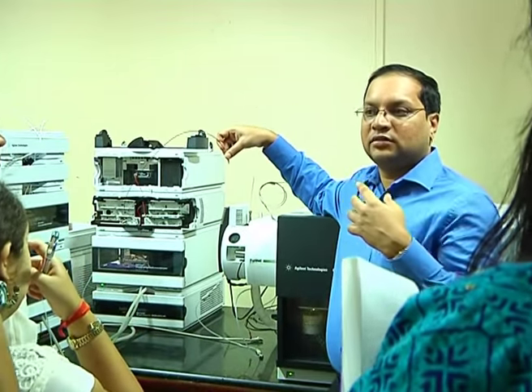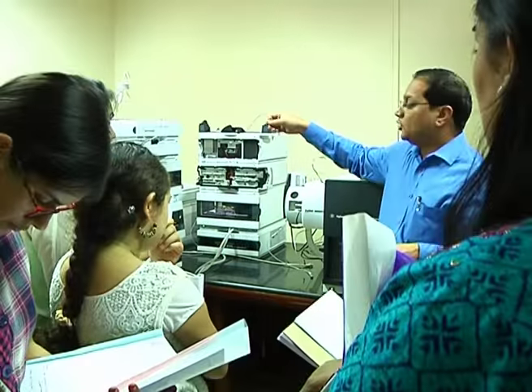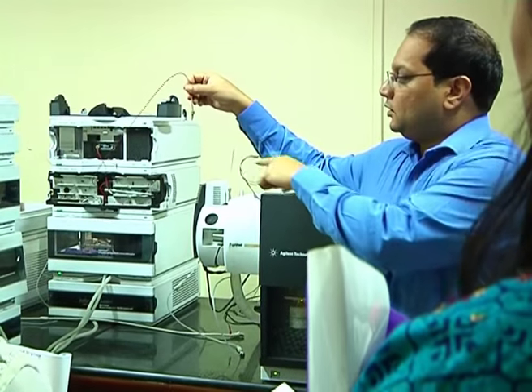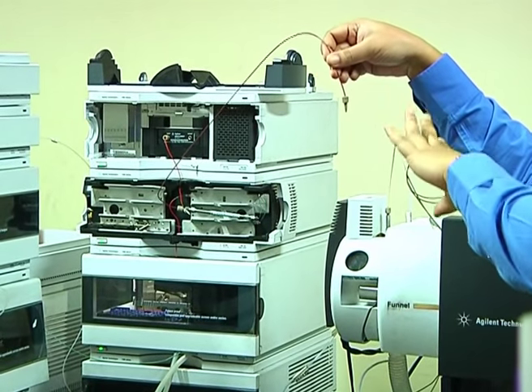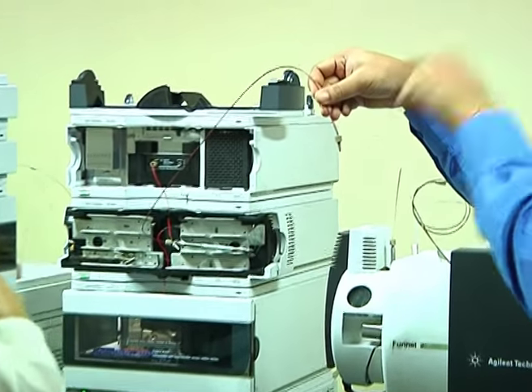With other MS sources in general, you may not be able to go beyond 0.5. Right now, at the initial stage when I have to load the sample, the flow is 3% organic and 97% aqueous. So more of water right now because I have to inject the sample.